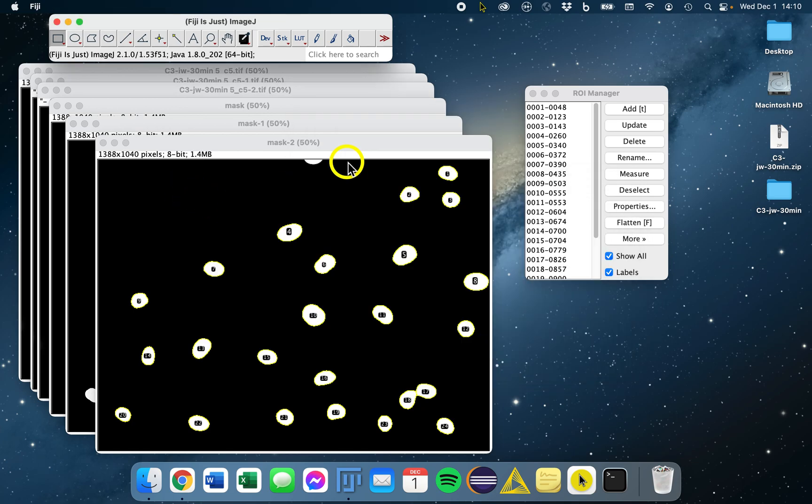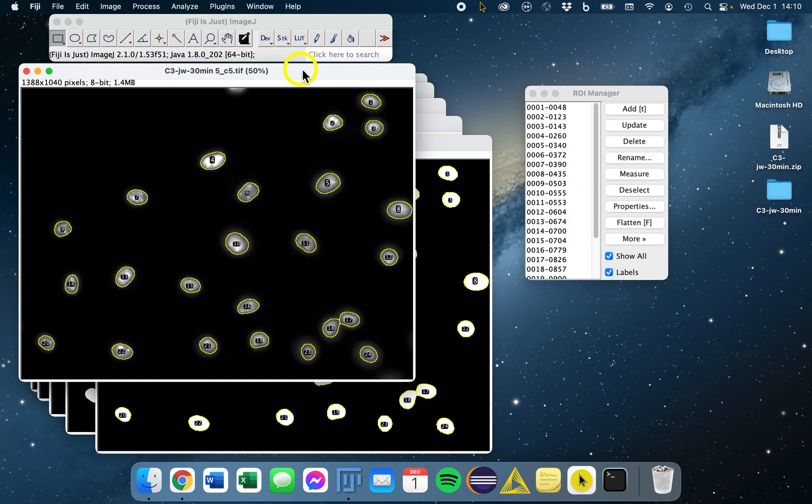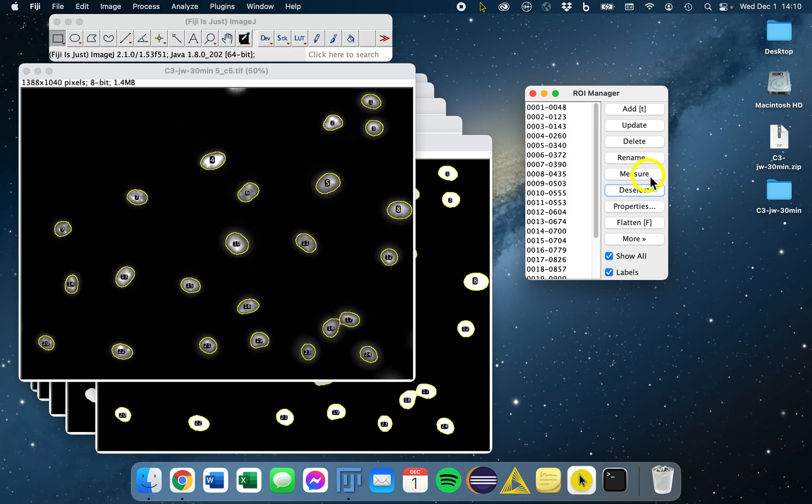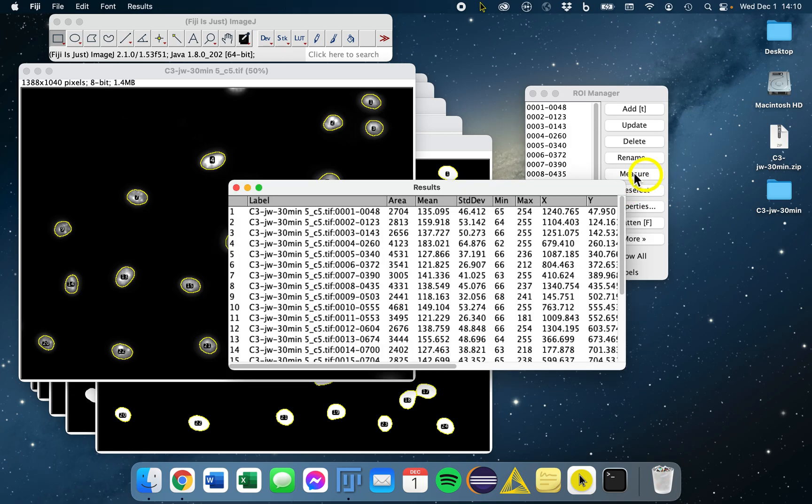So let's just toss this data, because that's incorrect. Let's pull up that original image, which should still be open. We can overlay these ROIs by toggling Show All. Then we will deselect, measure, and now we have our actual data set here.